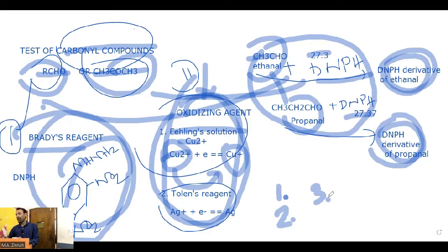Difference বেড়ে যায়. Okay, so we can easily identify them. We may measure the melting point and detect them. Them কারা বলো দেখি, them মানে কি?